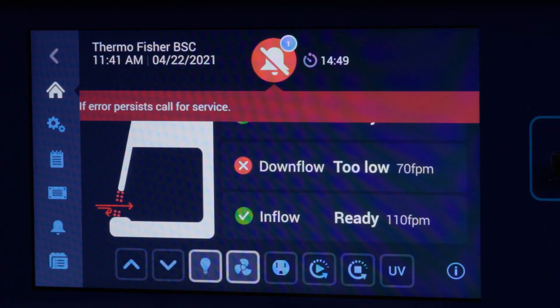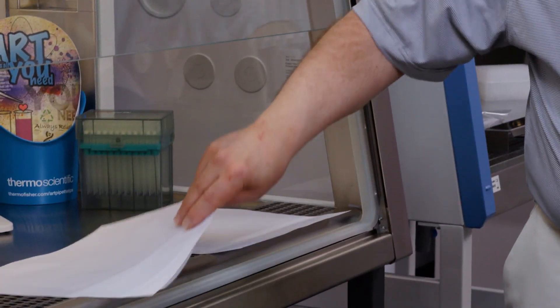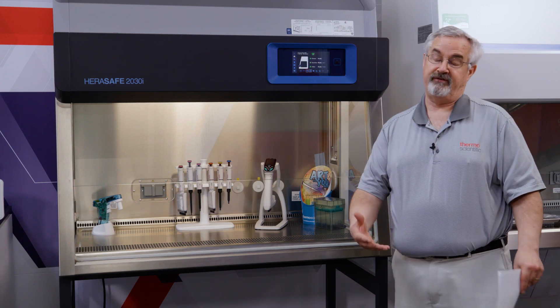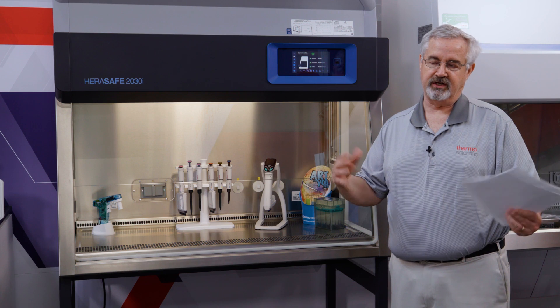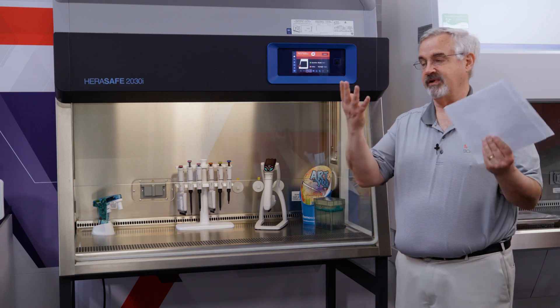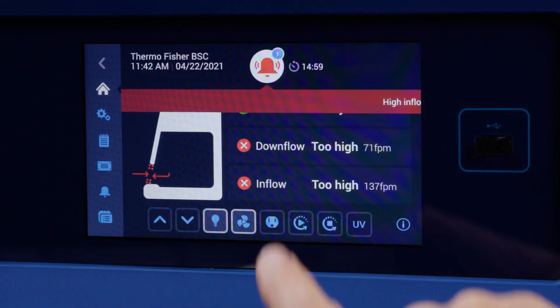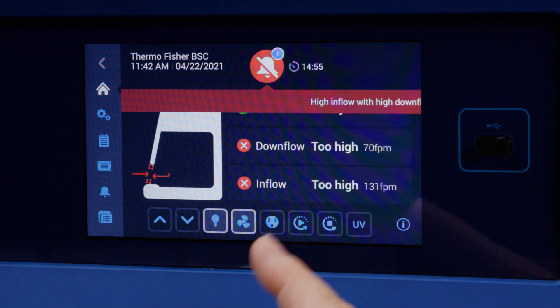Now I'm going to remove the papers to bring it back. At this point the fans sped up to compensate for my paper catastrophe, so some of the velocities may go too high. Here we have the inflow too high, and again, it's going to explain to me what the potential consequences are for that.